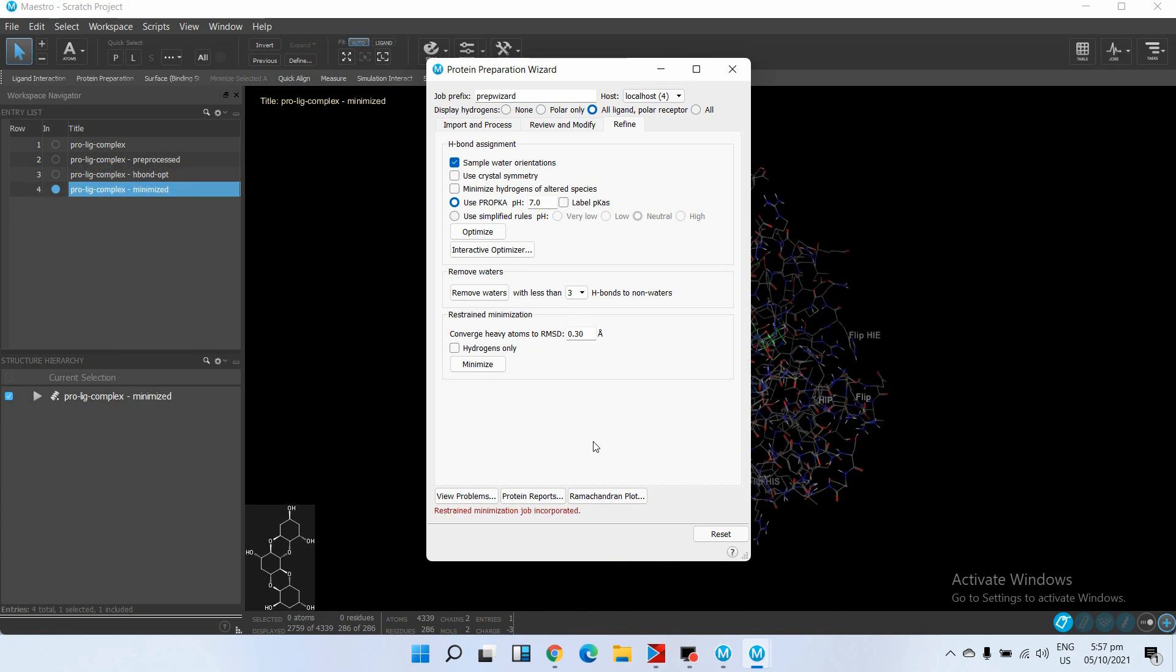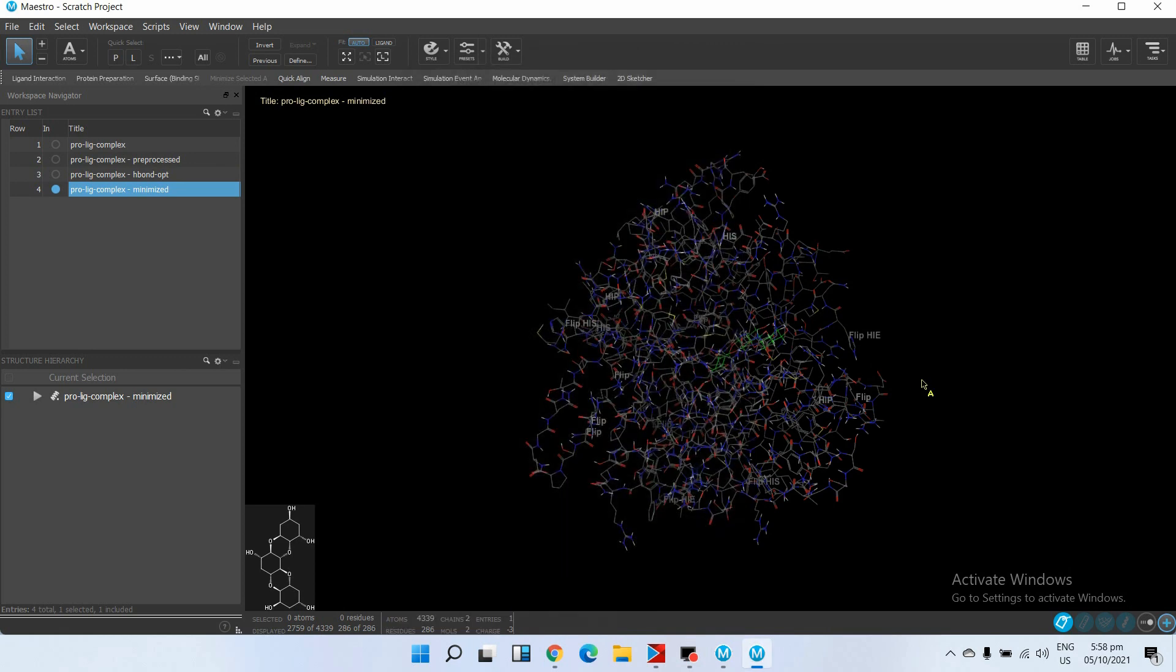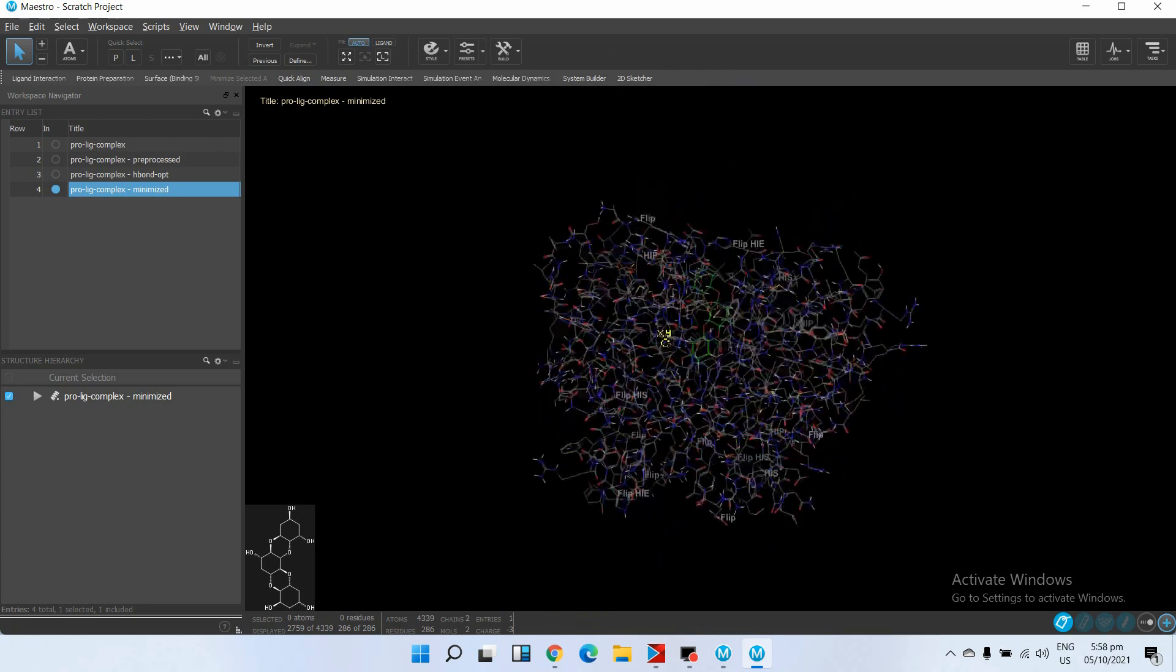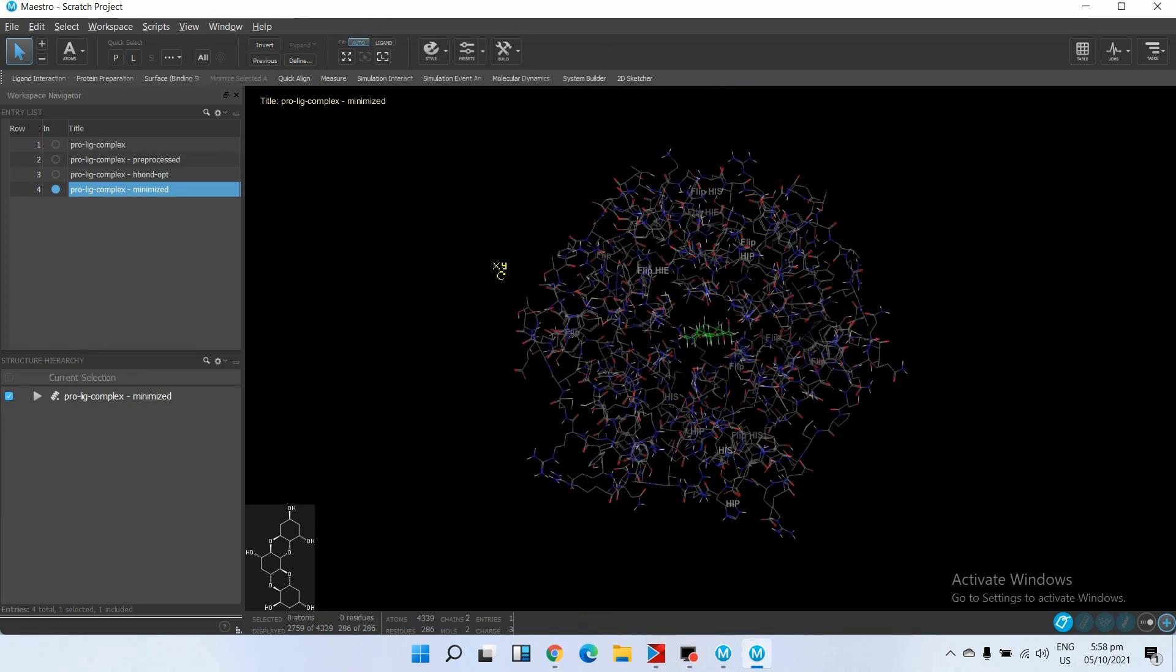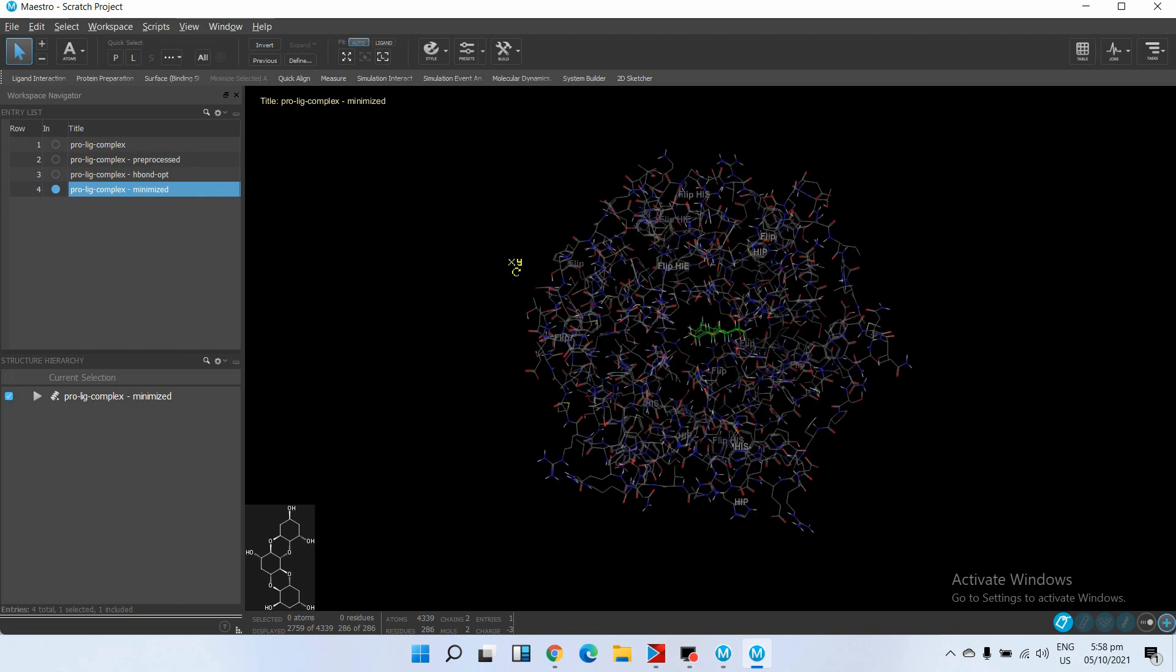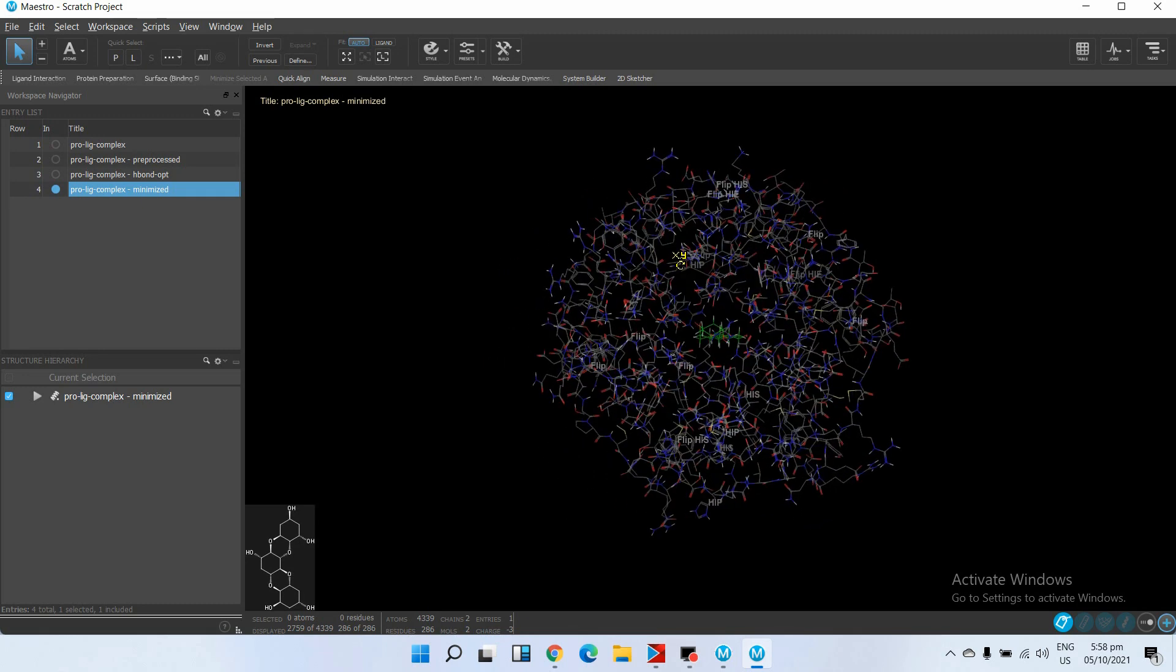The minimization job is incorporated. So now our protein complex is ready - it is pre-processed and ready for simulation. For creating a grid, in the next step we will create a grid box around this complex, select the water model, and set different parameters.